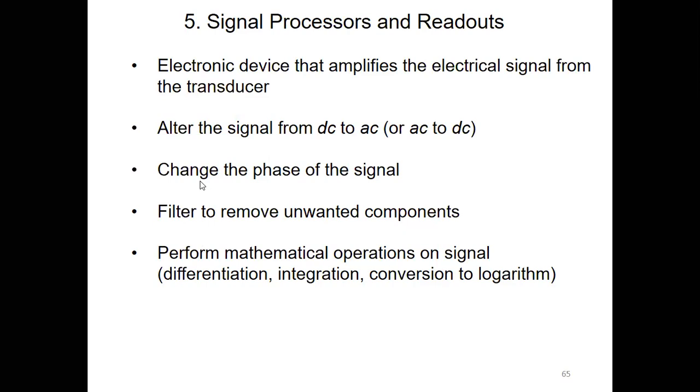And readouts, most of the cases, the readout device is a computer. Nowadays, in many modern instruments, the readout device is the computer. So we can easily see the spectrum and we can easily extract the signal from the computer. Okay, so far, we discussed the main components of the optical instrument. Whatever the spectroscopic method that you will use, there will be those 5 major components in this.